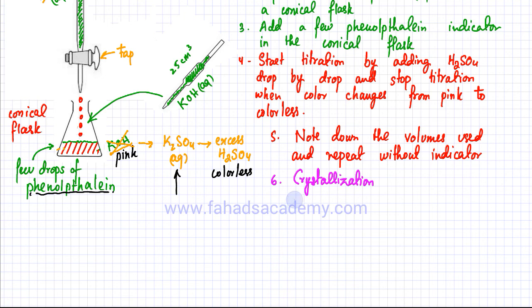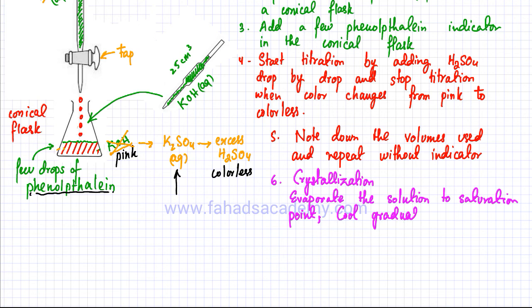You evaporate the solution to saturation point or crystallization point. Then you cool gradually, and you filter out the crystals that are formed.